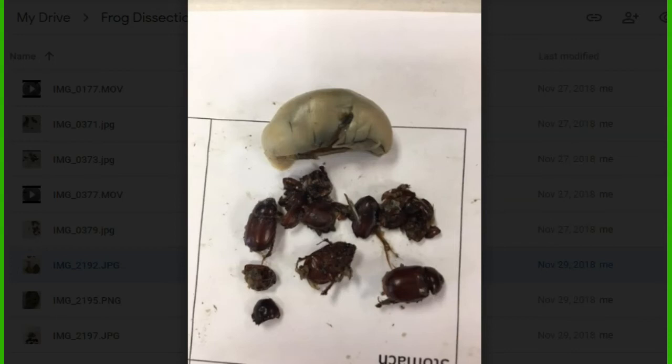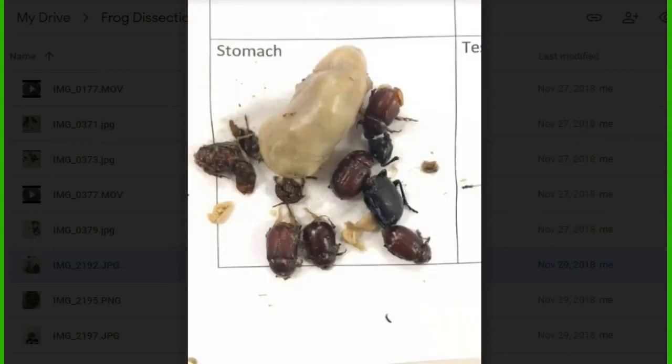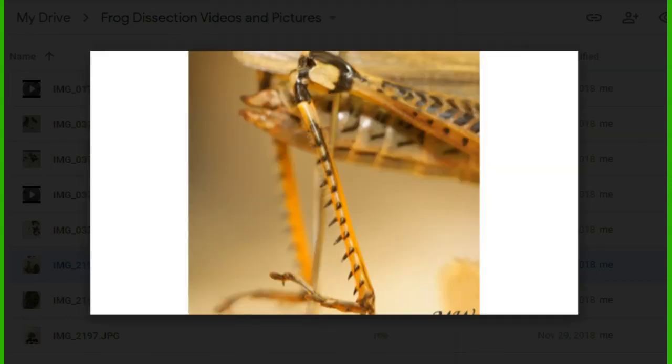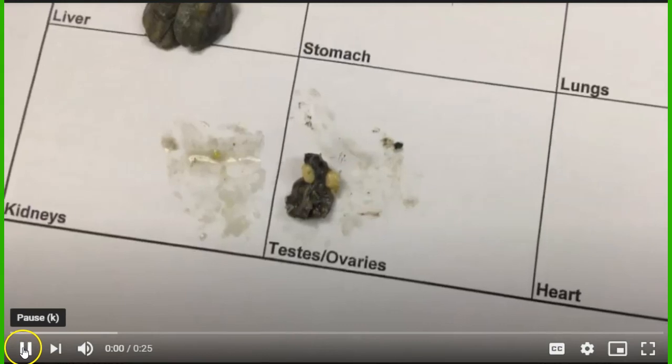You're going to see one more example of a stomach full of beetles, bugs. There's what looks like a water beetle along with the June bugs. So these frogs that had these things in them, they had a last meal before they died. Here's something we found in the stomach. This is 2 parts of a grasshopper leg that the frog just could not crush in its stomach. There you go. There's the comparison photo of a grasshopper leg. For those of you who didn't believe it, that's what that is.